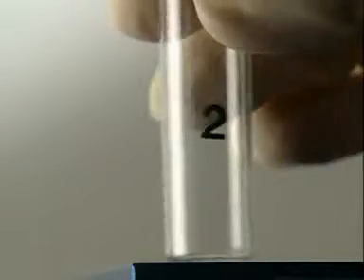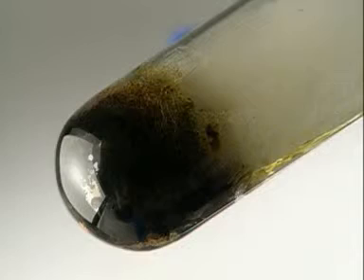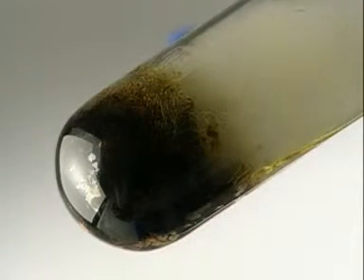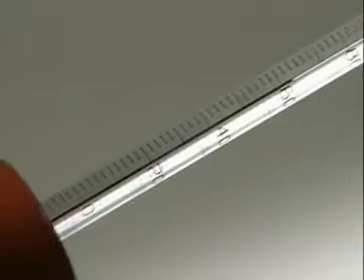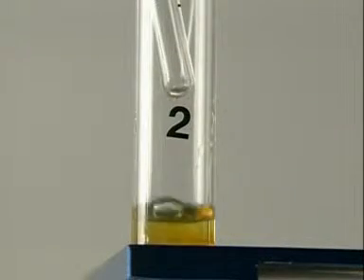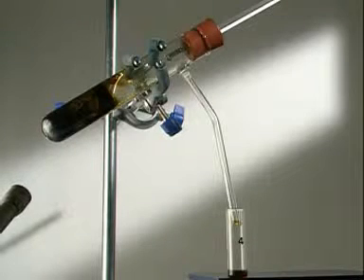Once the first fraction has been collected, it's safe to start heating with a Bunsen. As the temperature rises, other hydrocarbons begin to boil. A new fraction is collected at about 60 Celsius. It's slightly yellow in colour. And so the process continues.